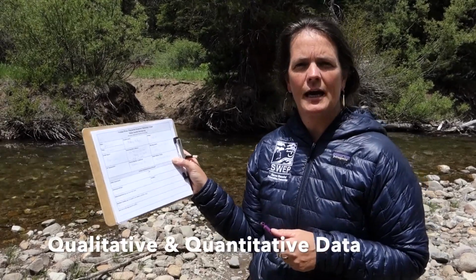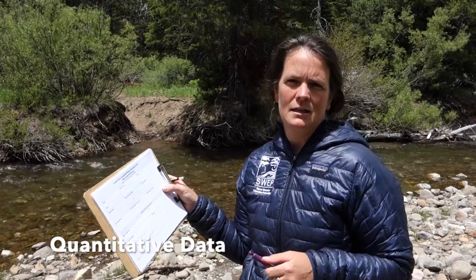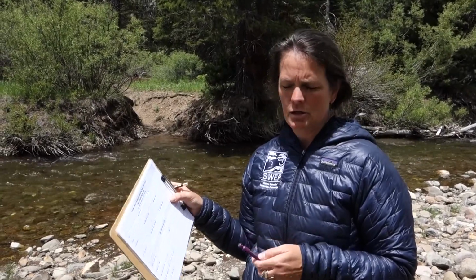And we're going to be looking at qualitative and quantitative data. So quantitative data is the numbers data, and that's the data that you're going to be using tools to capture. So the first tool we're going to use is a thermometer, and we're going to collect air temperature as well as the water temperature of our creek.